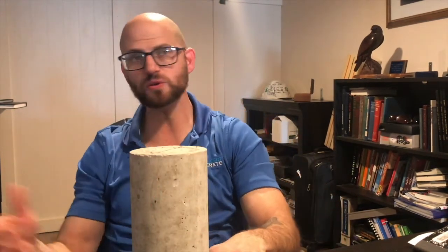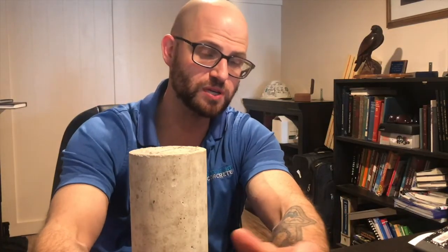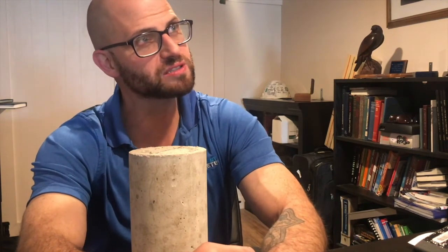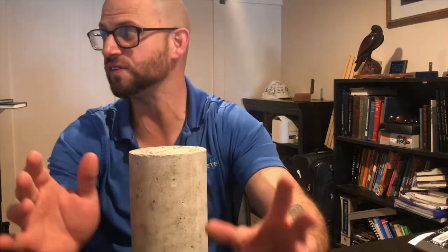So what I've included in the talk I'm giving is this scanning electron microscope photo of one of these troughs. And if you jump onto our website or some of our clients' websites, we've written articles about abrasion resistance of concrete. It's really hard to understand abrasion resistance of concrete because you have to look at so many different levels.